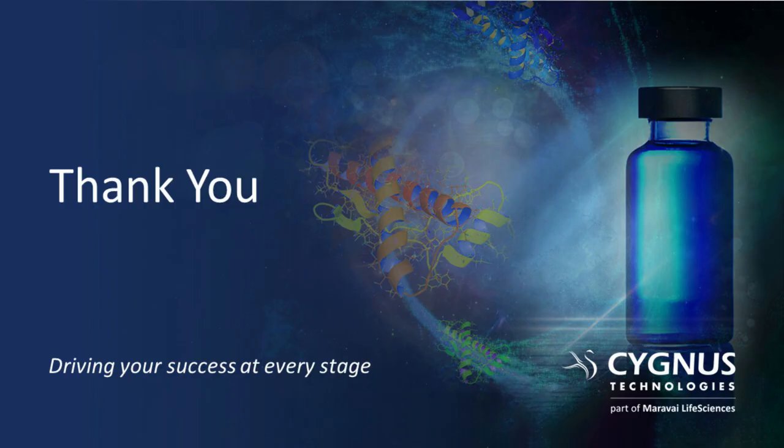And our next question is, what about those proteins that are not recognized by anti-HCP antibody? Will MS identify them? Yes, it's a great question. Obviously, no method is without limitations, right? With mass spectrometry, yes, we will be able to identify HCPs in the starting material.